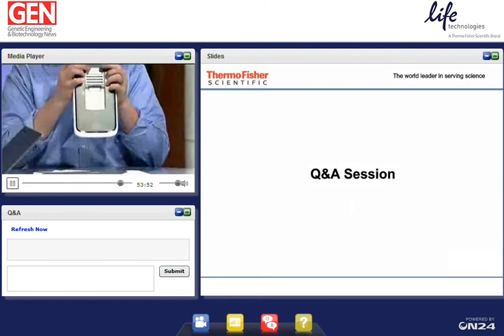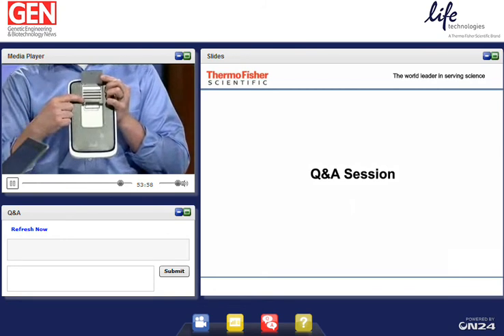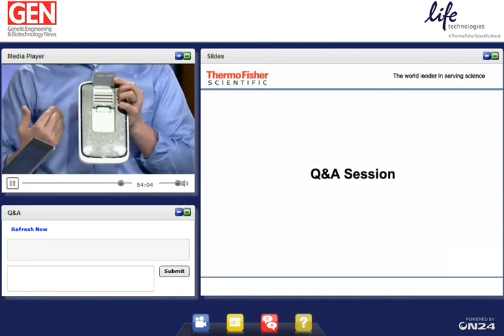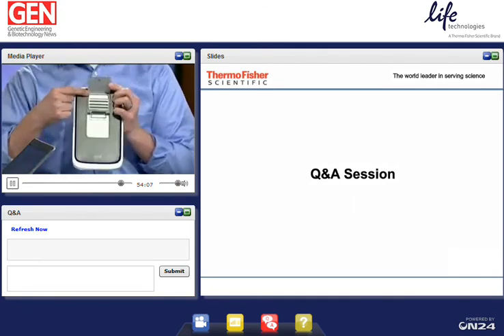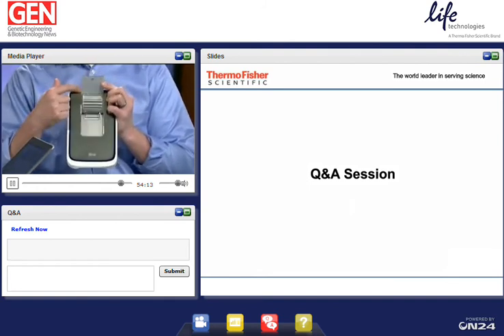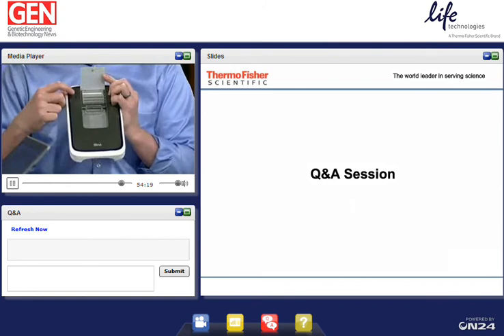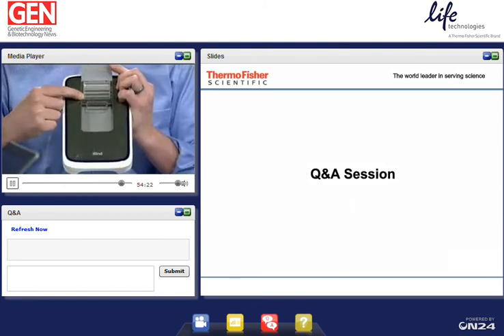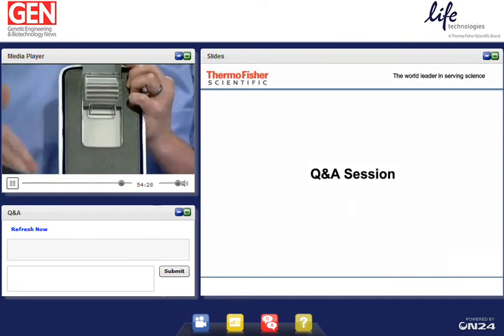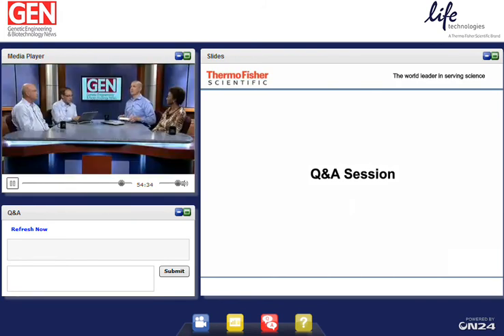So what you would do, and I'll try to be very quick about this, is the 2 mils of primary goes into well number one still, just like it always would. Now, instead of adding a secondary, you want to get onto the wash steps. The final wash step is 6 mils in well number 4. So in wells 2, 3, and 4, which are 3 wells, you take that 6 mils that would normally be a wash and you break it up across the 3 wells. So it's your 2 mils of primary with your fluorophore antibody, and then 2 wash, 2 wash, 2 wash, and you're done. And it actually runs shorter because overall there's less fluid going through the system, so it actually runs even faster. Yeah. So hope that clarifies that.